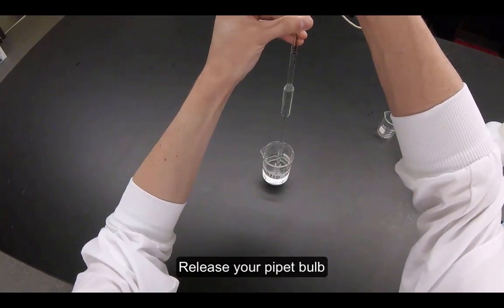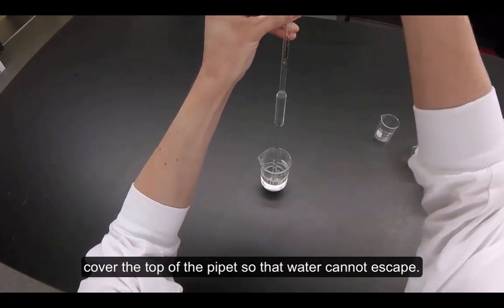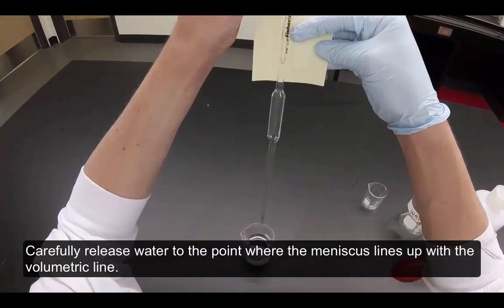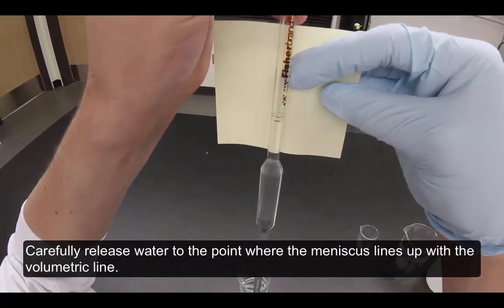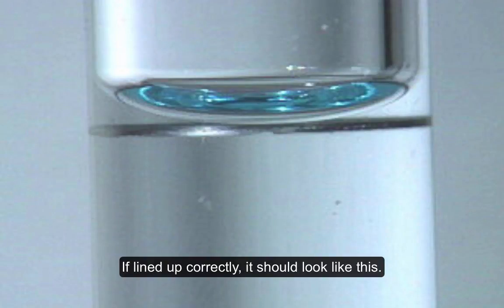Release your pipette bulb and using your hand without the glove, cover the top of the pipette so that water cannot escape. Carefully release water to the point where the meniscus lines up with the volumetric line. If lined up correctly, it should look like this.